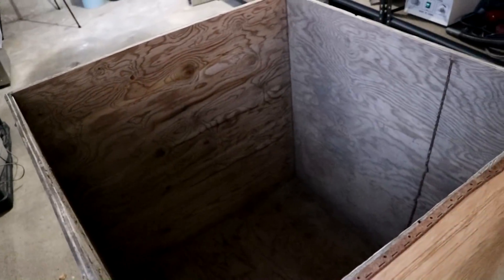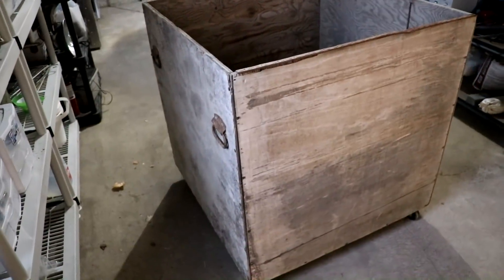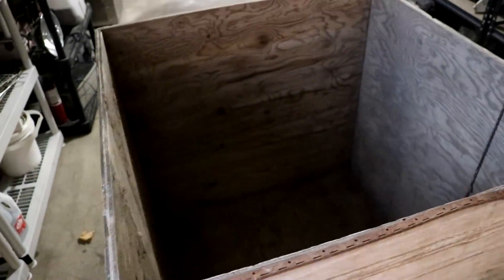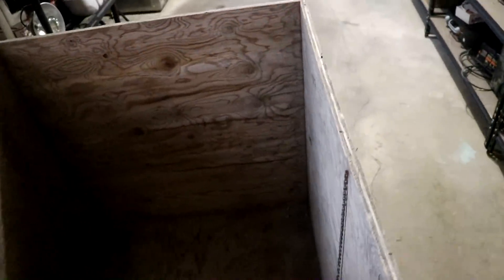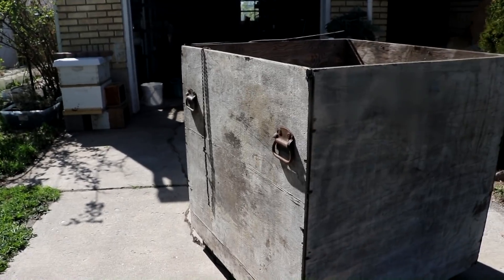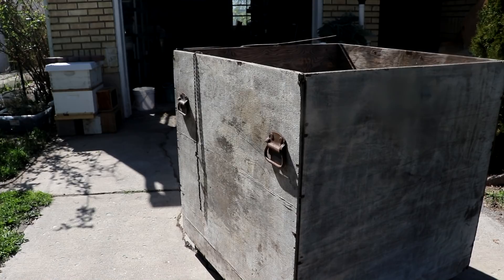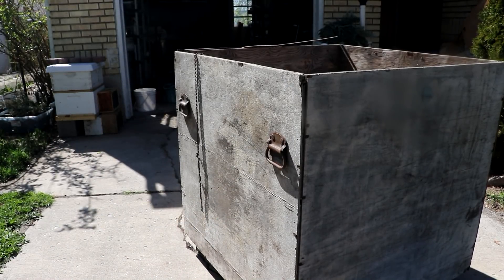It's got some little castor wheels. I'm actually going to take all that stuff off, sand it, paint it, and then put a door — something that will slide up and down on the front. I'll probably buy some acrylic sheeting for that. I've pulled it outside — you can see the bees are over there — and I need to paint it, so first I need to take off all these little things. Let's get working on it.